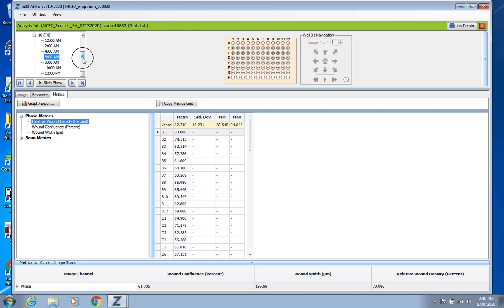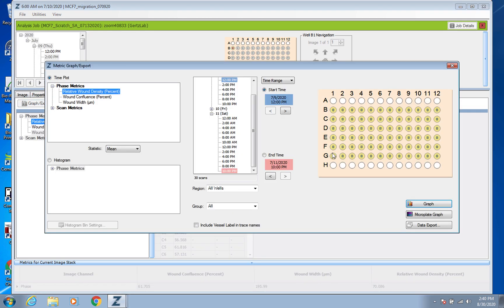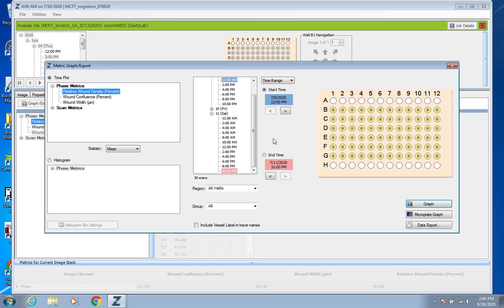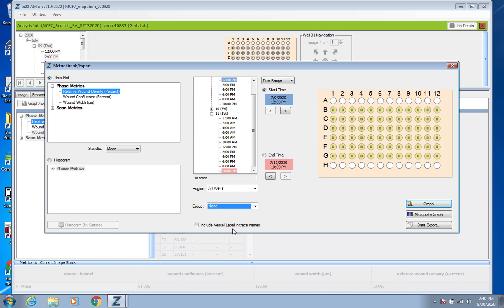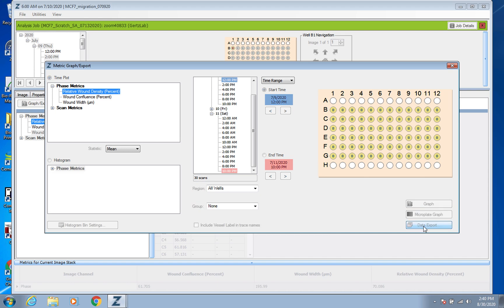So again you're going to do Graph Export. Make sure it's clicked on Relative Wound Density and here the process is again pretty much the same. Pick your time range, go to Group and make sure you click None.